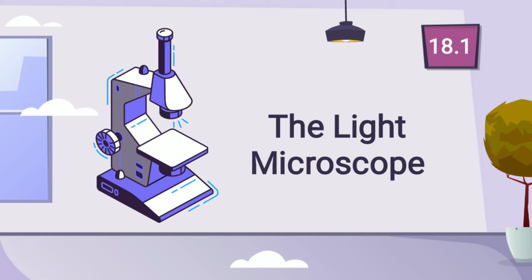I know that we are all very familiar with what a light microscope is because I believe that we've already tackled this during our high school biology class and even during grade school, di ba? We were already taught about the parts and functions of the microscope. Today, let us just do a recap. We'll dig deeper into this topic. So, are you guys excited?